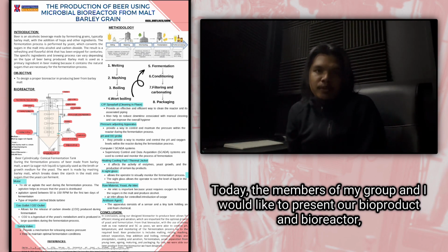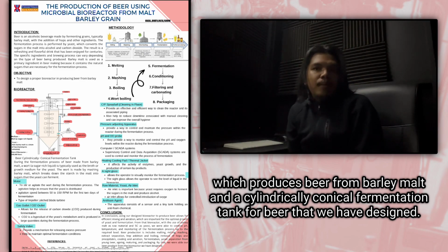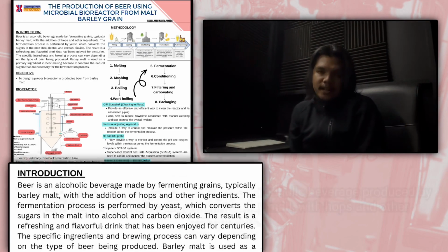Today, the members of my group and I would like to present our bioproduct and bioreactor, which produce beer from barley malt, and a cylindrically conical fermentation tank for beer that we have designed.